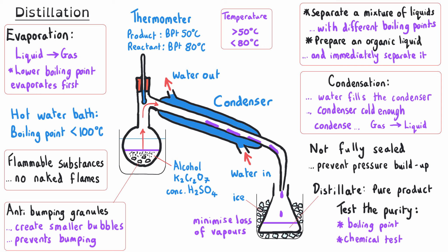Exam questions might show you a diagram of a distillation and ask you to identify mistakes and explain problems they could cause. One really common problem is the water going in and out the wrong way round. In that instance, you would need to say the water would not fill the condenser properly, so the condenser would not be cold enough to ensure the gas fully condenses, and so the yield would be reduced. You can see from the diagram that a condenser is only about 50% filled with water when water enters at the top. When water goes in at the bottom, the cooling jacket is fully filled, ensuring efficient cooling of the vapors.